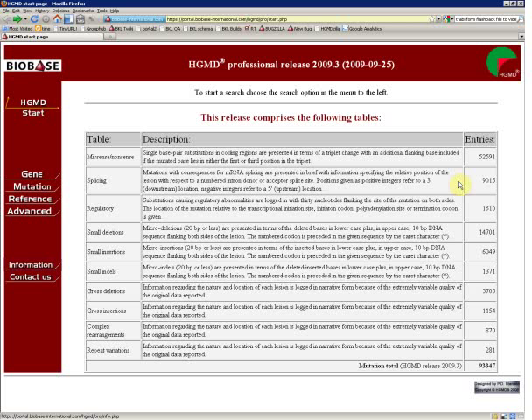This is the entry page of HGMD Professional. As you can see, there is a wide range of different types of mutations recorded in the database, starting from missense and nonsense single nucleotide mutations, or SNPs, all the way down to gross deletions, insertions, and complex rearrangements.